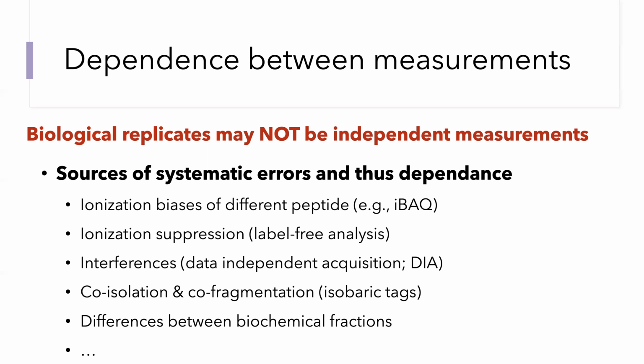This bias is particularly relevant when we perform the estimates using estimates of absolute protein abundance, because the absolute protein abundance in one set of conditions can use one set of peptides, in another set of conditions can use another set of peptides, and differences in the inherent ionization efficiencies of those different peptides might provide a systematic difference that is being interpreted as differential protein abundance, while in fact, we simply have differential peptide detection and peptide ionization.